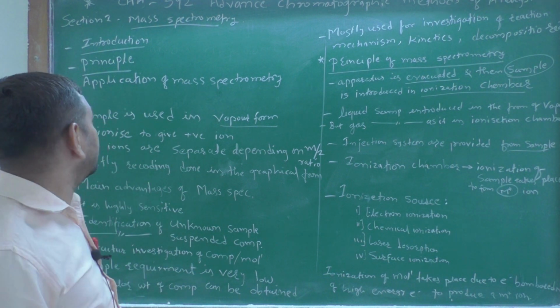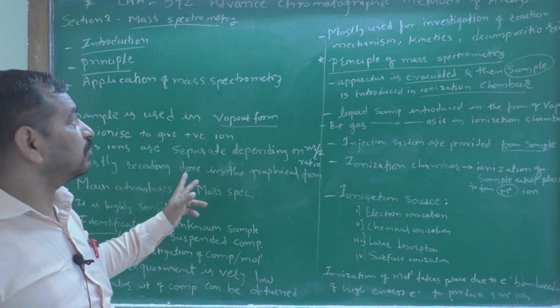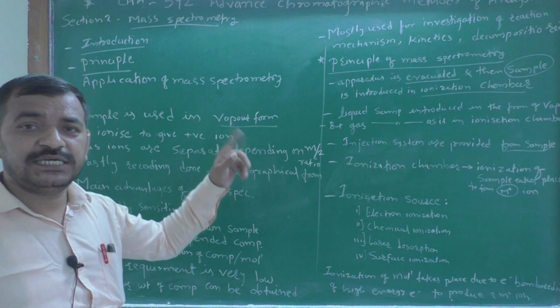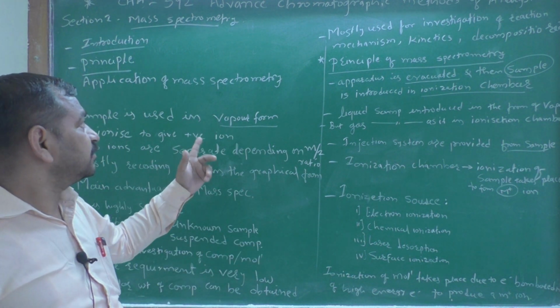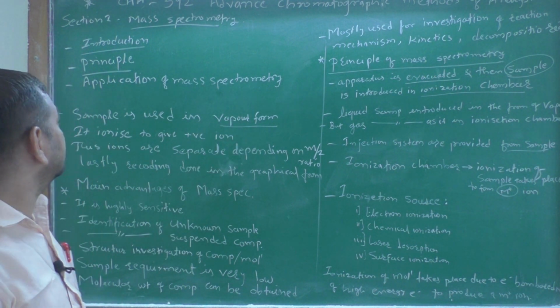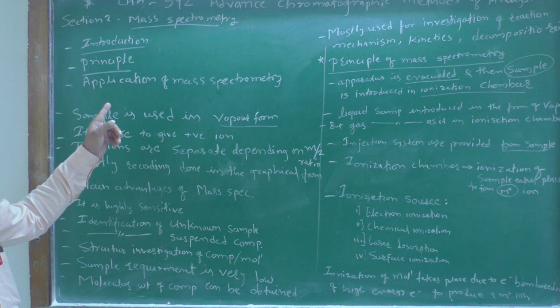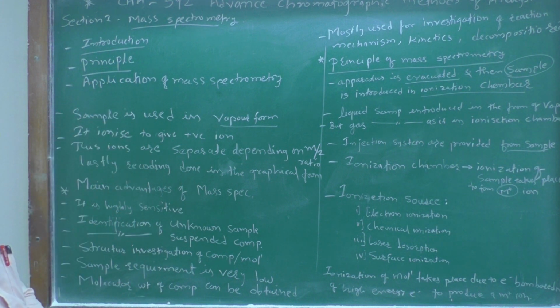Today we talk about mass spectrometry. It is the instrumental part. Actually, mass spectrometry analyzes organic molecules. Here, first the introduction, then the principle, and second the applications of mass spectrometry.